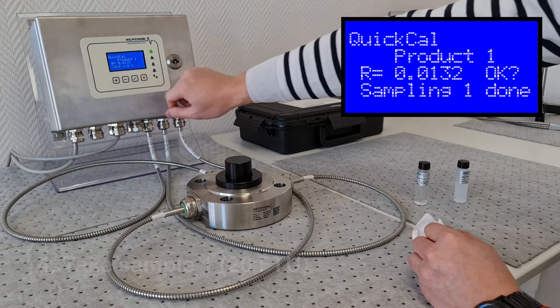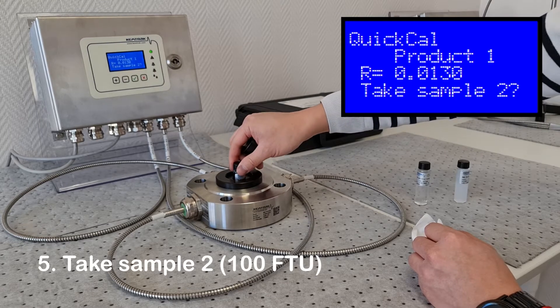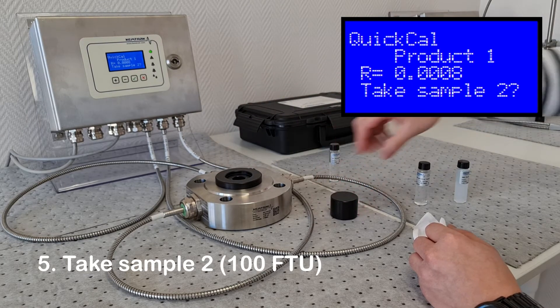When complete, confirm the measurement, then place the 100 FTU calibration standard in the holder and repeat the procedure.